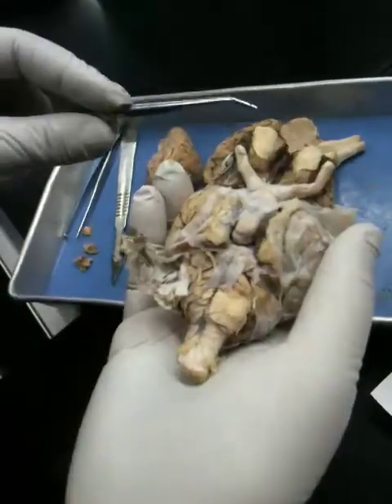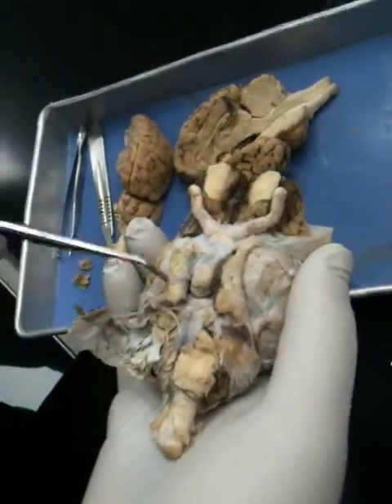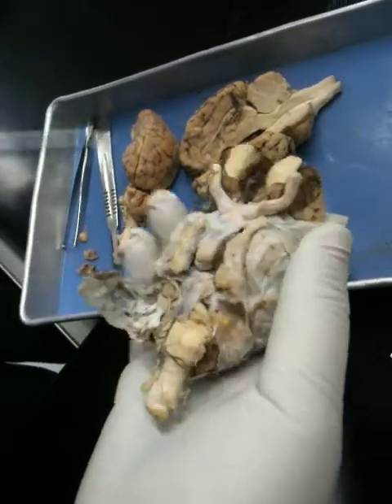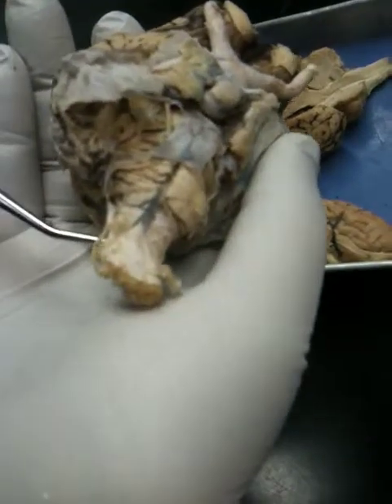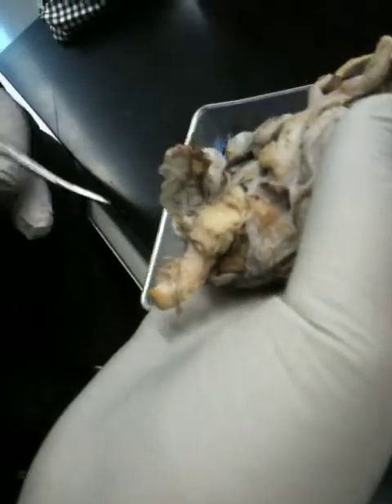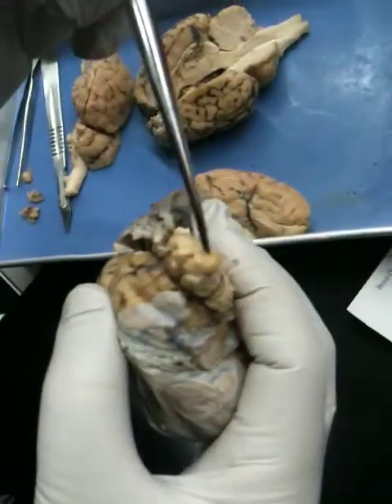Here you can see cranial nerve 1 and 2. And this is the optic chiasma. This is the pituitary gland. This is cranial nerve 5 — it's the trigeminal nerve, so there's three stumps right there. This is cranial nerve 6 right here. Cranial nerve 11 — that's a good one, that's why I'm keeping this one. And cranial nerve 12 here. This is the central canal right in the middle of the spinal cord, and you can see the H.